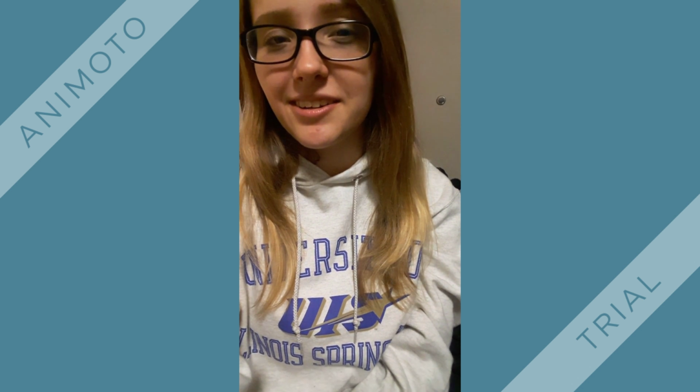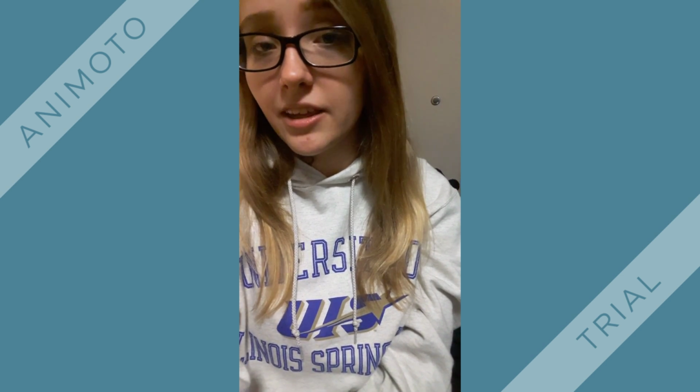Hi, my name is Annabella Paradise, and today I'm going to be showing you how to use mass spec, IR, proton NMR, and carbon NMR graphs in order to determine the structure of a molecular formula.